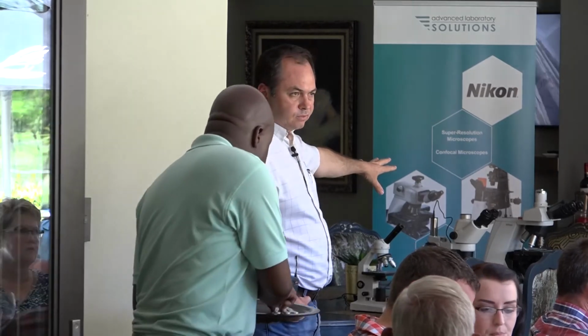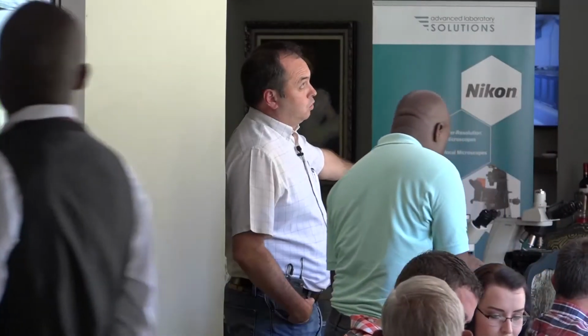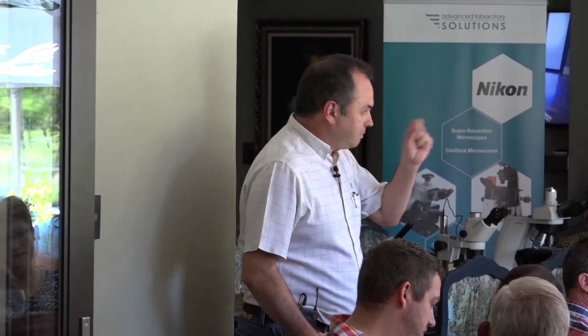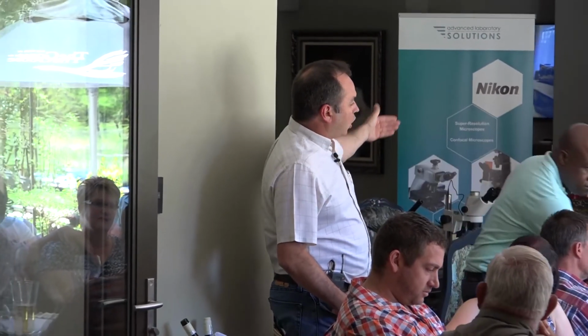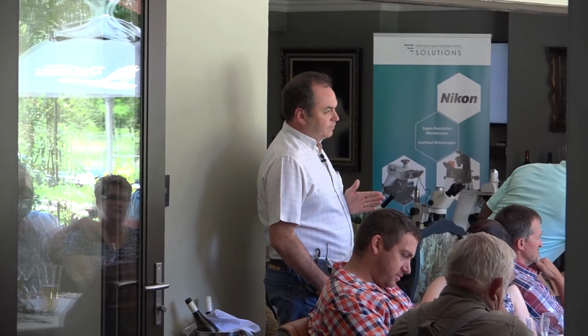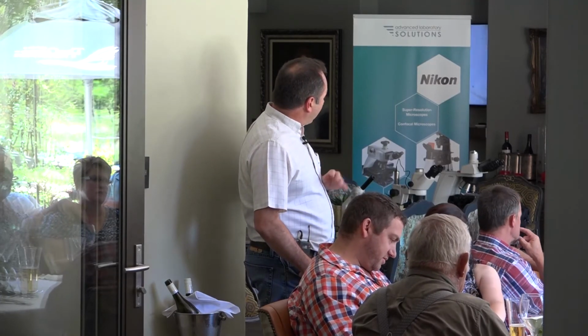The microscope itself, the reality with microscopes is that in the past 30 years, actually more, in the past 50 years, very little has changed. If you look at a microscope from 50 years ago and a microscope today, they've maybe become 10% better. But all the evolution in the microscope was from the last century, the turn of this century, probably up to the 50s. From the 50s and 60s onwards, we'd reached the limit of what you can do optically with a microscope. So I often say to people, if you've got a very good quality microscope, keep it.